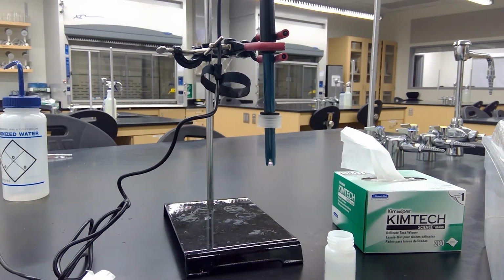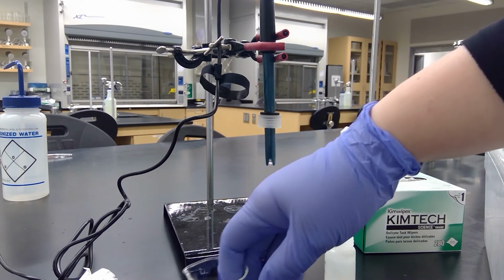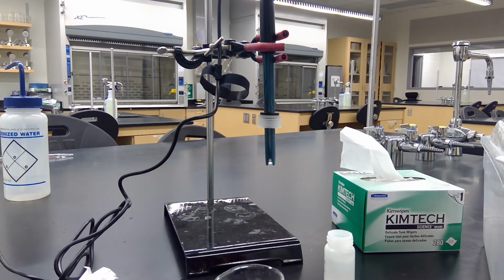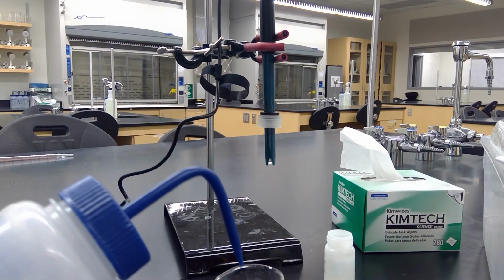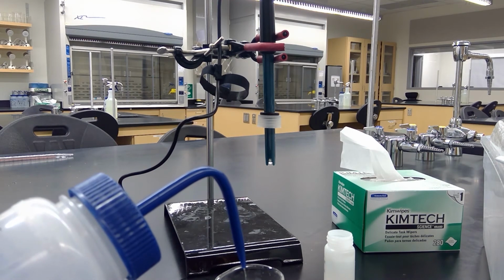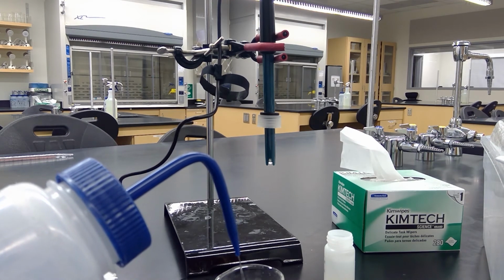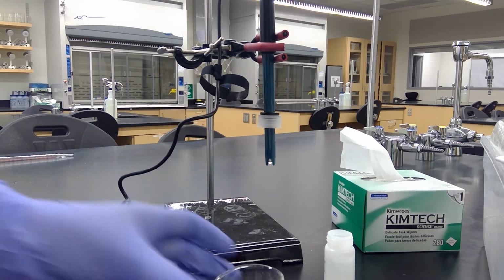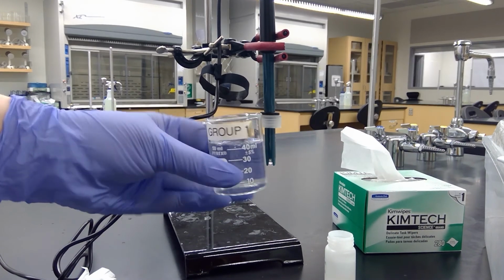And then use about 40 mils of distilled water in a 50 ml beaker to rinse the pH sensor. So you'll grab your 50 ml beaker and fill that with deionized water. So about that full.